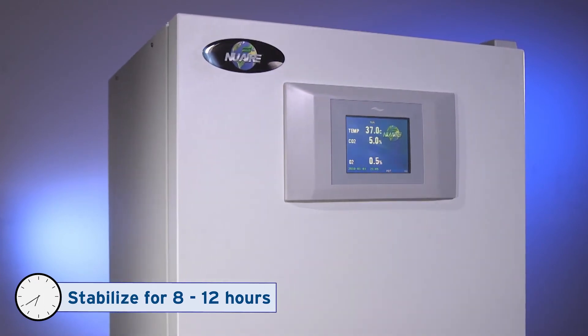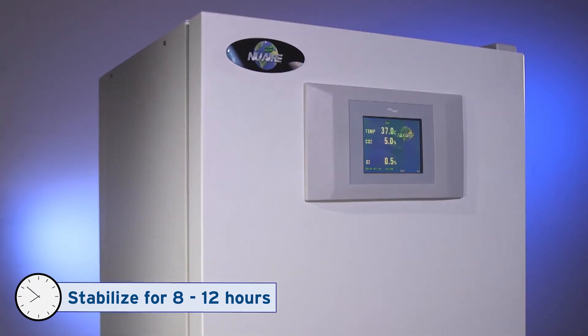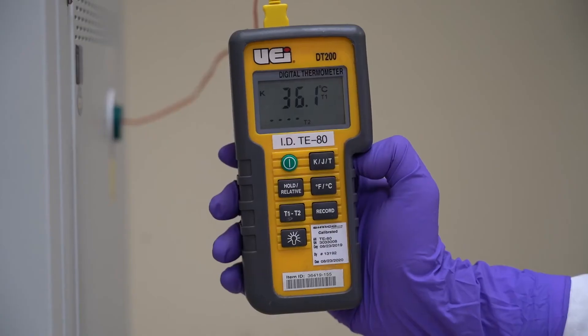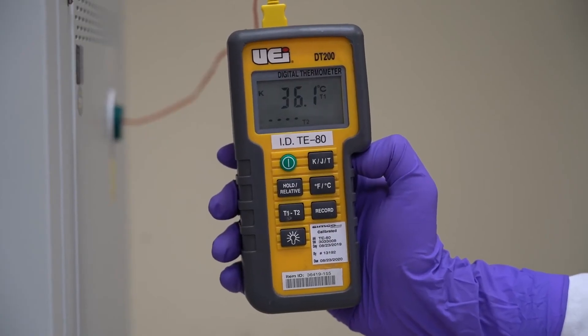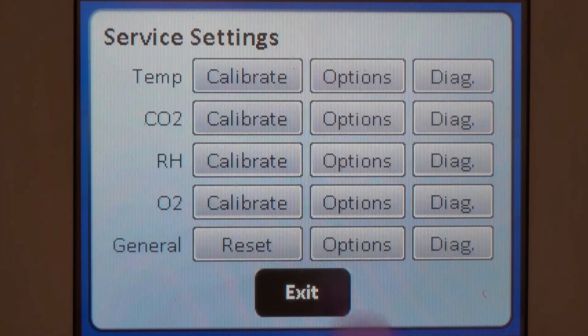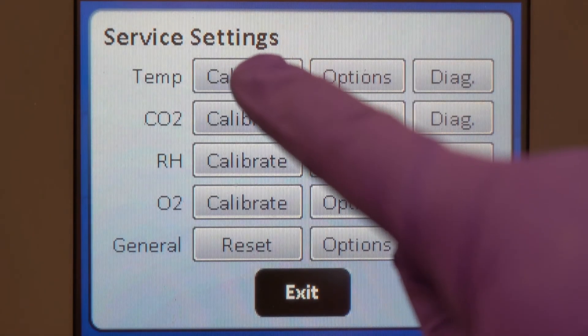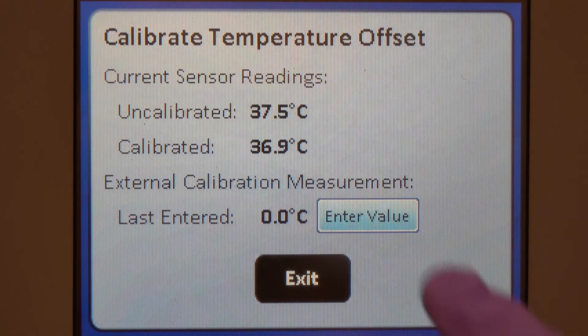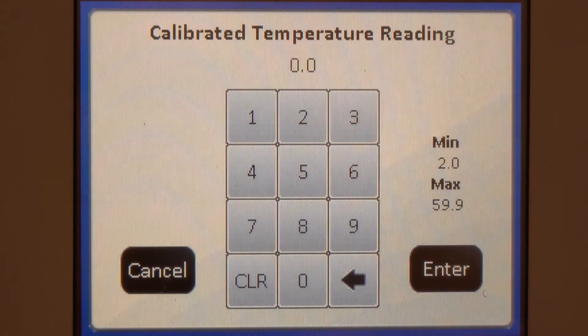Let the incubator stabilize with the door closed again for 8 to 12 hours. Take another independent reading and enter it again as the calibrated temperature reading. Repeat this process until the temperature read by the incubator and independent device match.